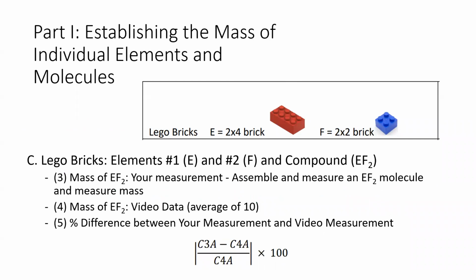After that, part 3, it wants you to measure the mass of molecule EF2. So you can assemble EF2 by putting together all 3 of your bricks and measuring the mass. And you could also record the video data, which is the average mass of 10 EF2 molecules.